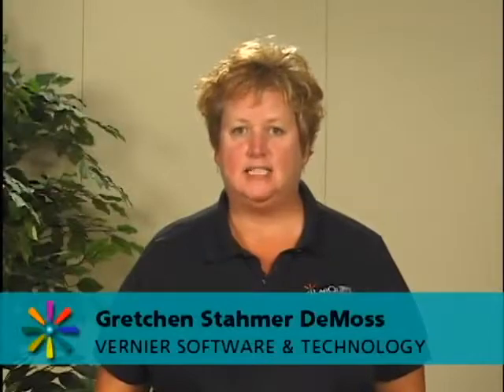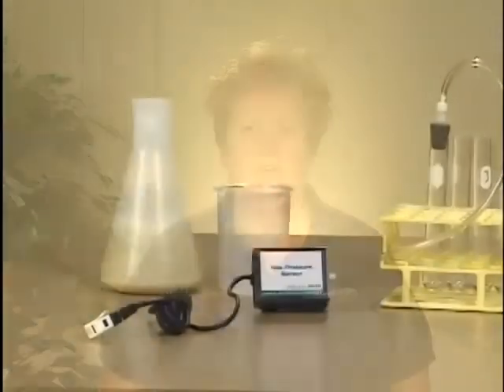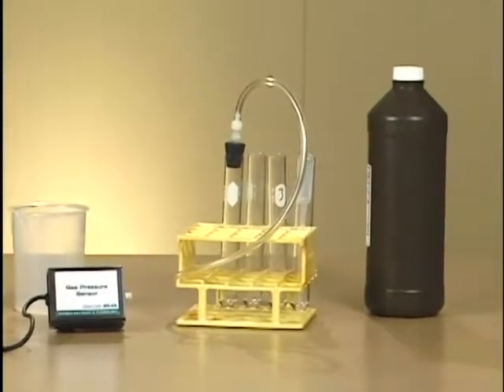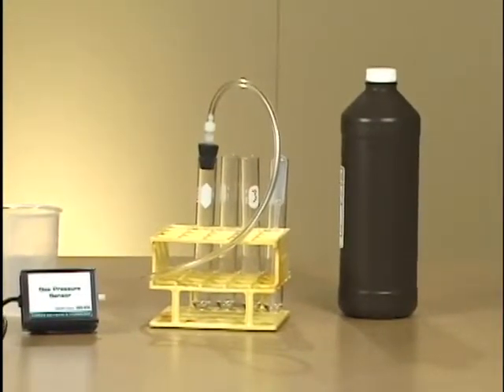This is the enzyme action testing catalase activity from the Biology with Vernier and the Advanced Biology with Vernier lab manuals. This is a very popular lab for general biology and is one of the required labs for AP biology.